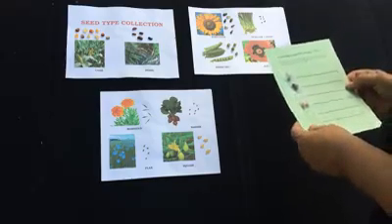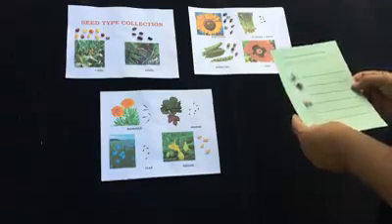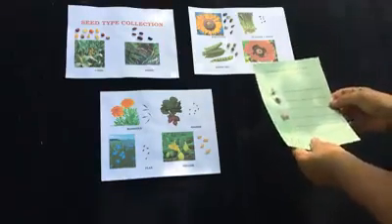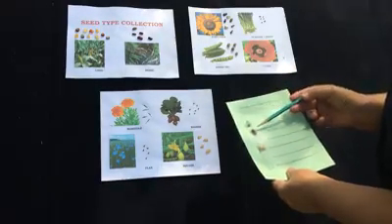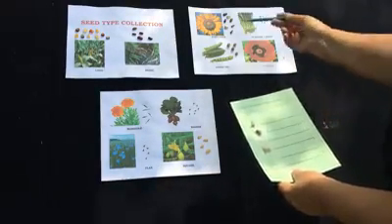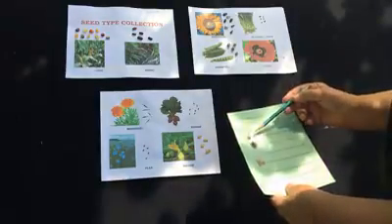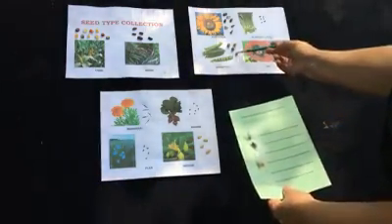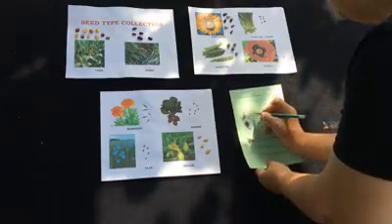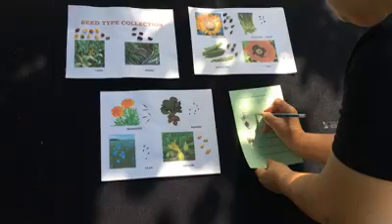All right, so now you're over at the seed type collection with your student, and what you're going to do is help them to figure out what kinds of seeds you have taped to your card based on what's in the type collection. Looking closely here, I can see that my first type is a green pea. And so we'll want to write that down on your card.